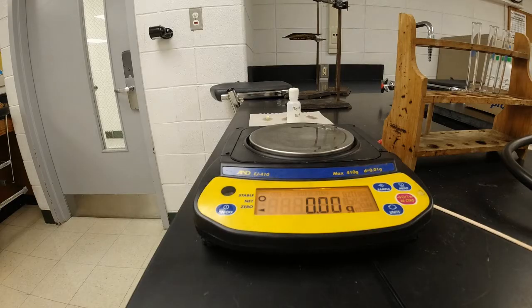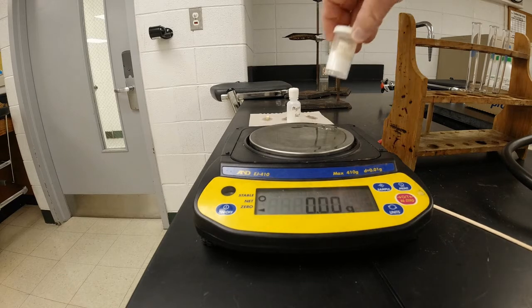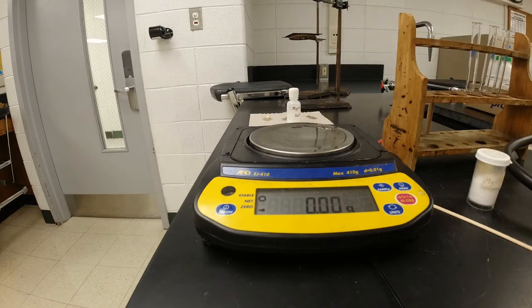All right, so we're back here. Part C. What we're going to do is use the laboratory balance here, and we're going to measure out 1 gram samples of magnesium sulfate. That would be that stuff. 1 gram sample of calcium sulfate, and 1 gram sample of barium sulfate.